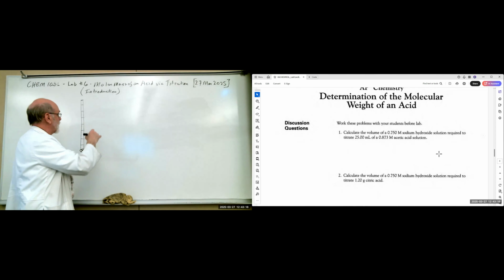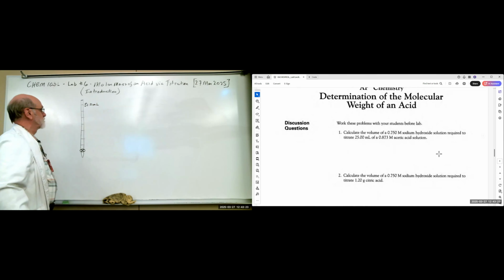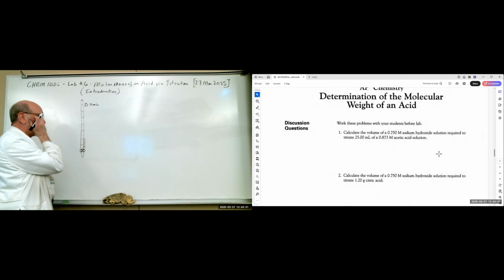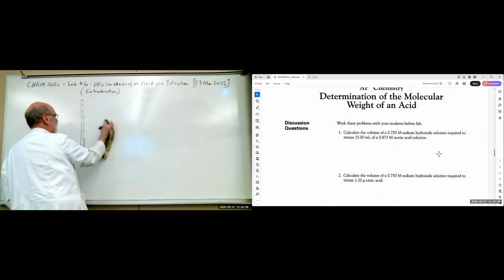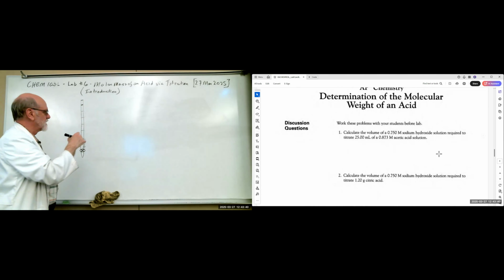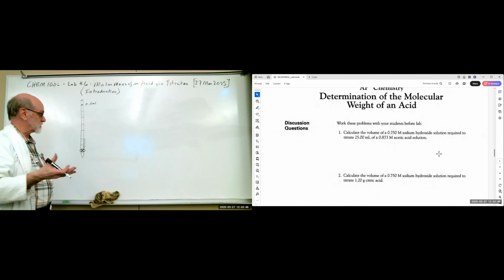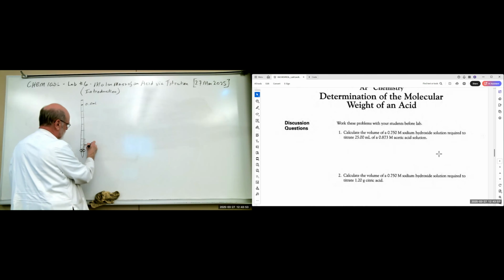our particular burettes are a total of 50 milliliters, accurate to a tenth of a milliliter. So we have fine divisions in here also. Now, actually, I put that on the wrong side. It will hold 50 milliliters to this top mark, but that top mark for a burette is given as 0.0 mils. Okay, so it's inverted compared to graduated cylinders. So down here at the bottom is going to be our 50 mil mark.